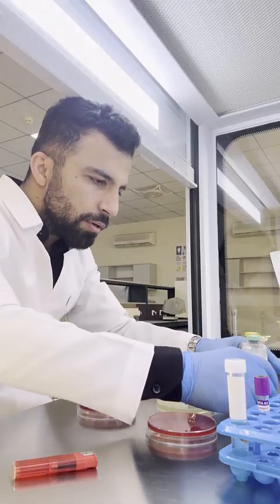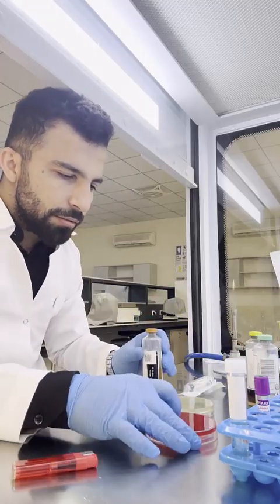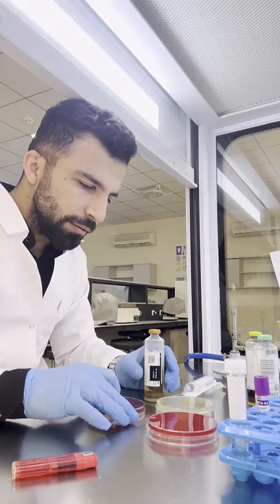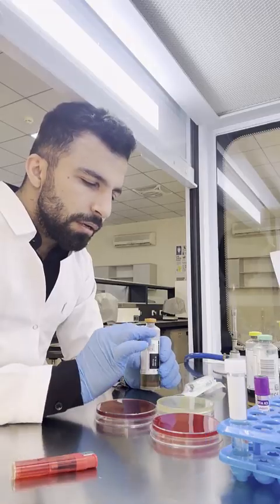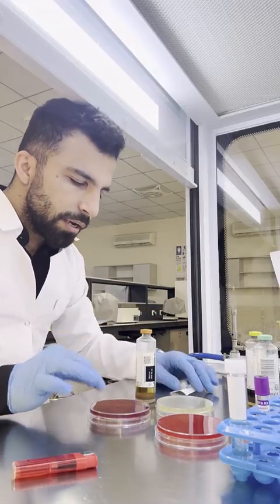And now we are going to culture blood on blood agar. Now the blood, we can culture it on blood agar, nutrient agar, and also MacConkey agar.